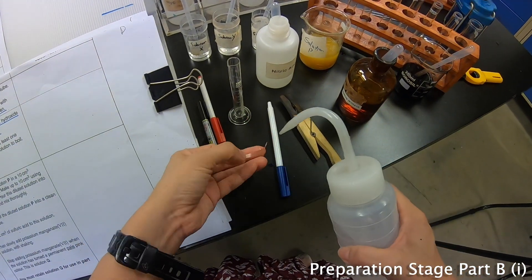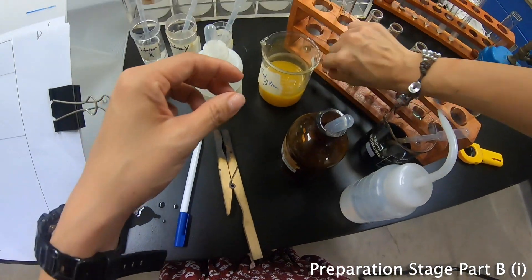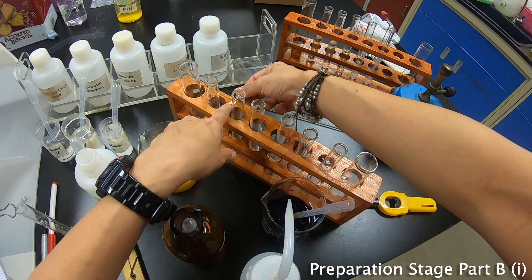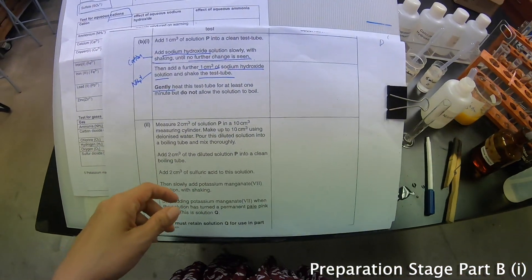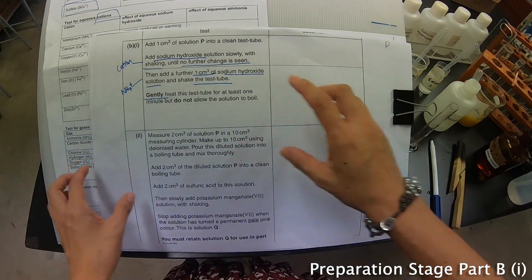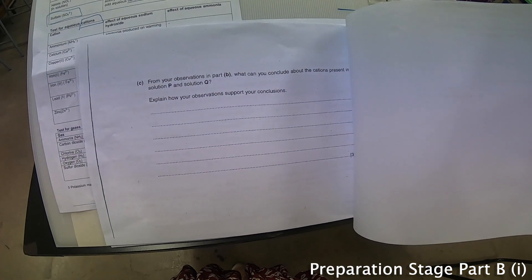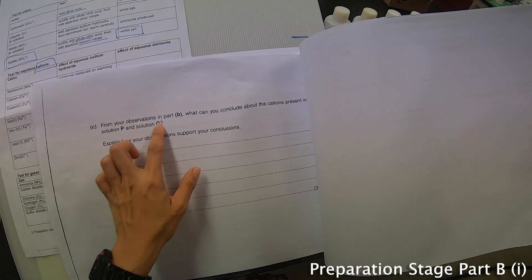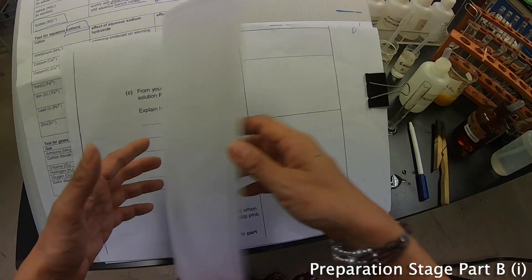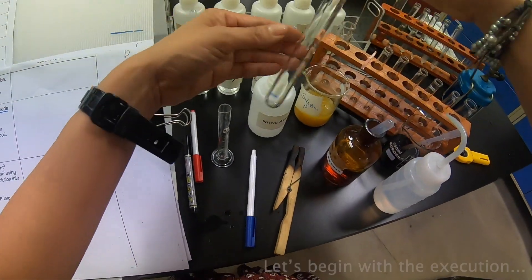I'll damp the litmus paper with distilled water and put it nicely to the side. Now I will start this portion first and we'll do the other part later. Let's see what they are actually looking for with solution P. This is P and this is Q. The last part asks what you would conclude about the cations present in solution P and solution Q. We already know there are two cations we are looking for.